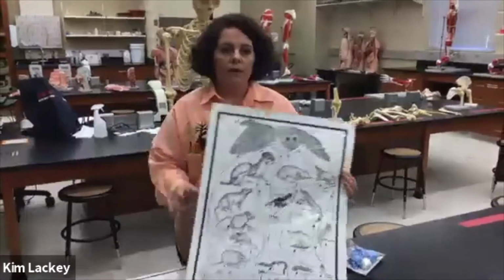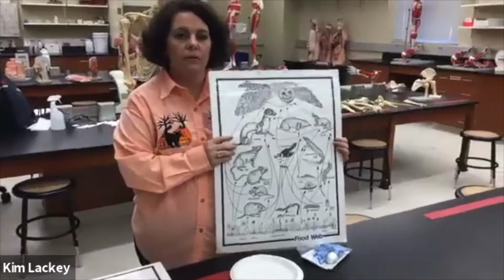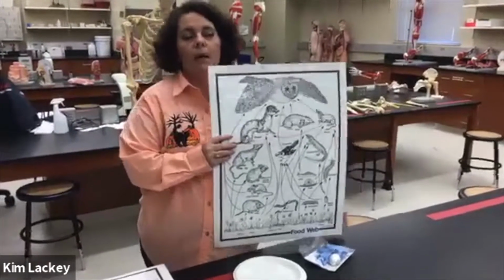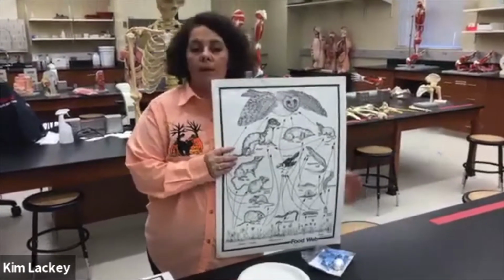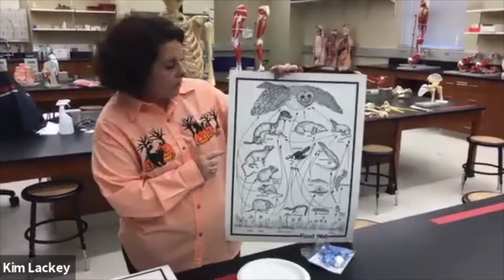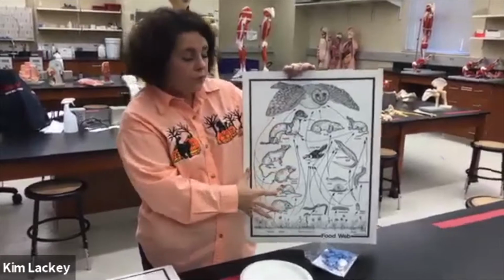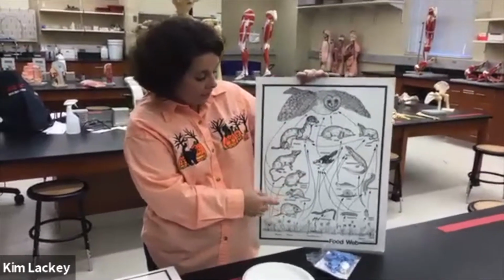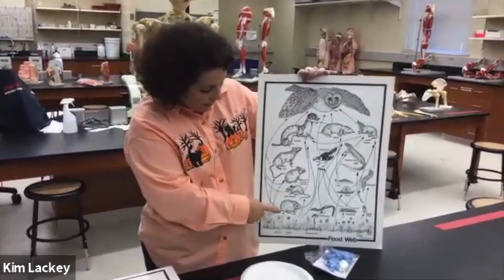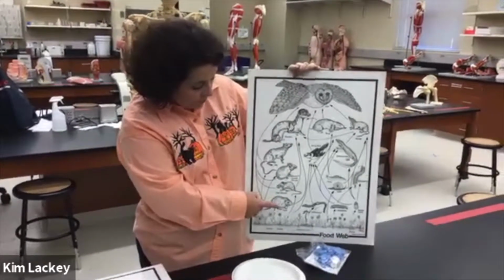So welcome, and we're going to be talking about owls, and we're going to actually see what the owls are digesting and eating based on the pellets that they produce. As a reminder, we've got the owls up here, and we have a whole large food web that's associated with them. One of their common prey are going to be voles or moles.